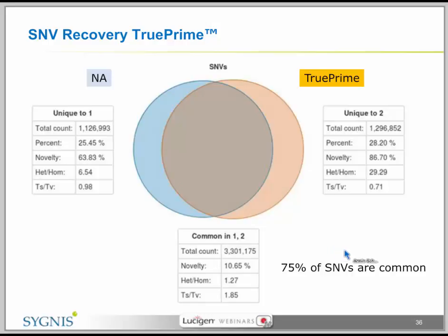And we did this using these deep sequencing data. And you see here on the left-hand side the non-amplified sample. These are all SNVs detected. We used a very sensitive algorithm from the CLC workbench and compared this to the TruePrime sample. And we looked at the overlap here between the SNV space between both methods, and we detect 3.3 million SNVs in common in both samples.